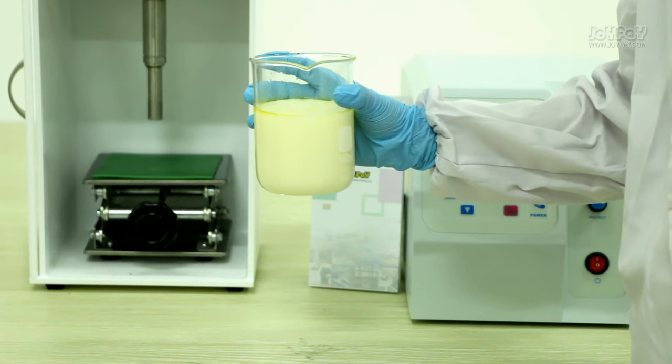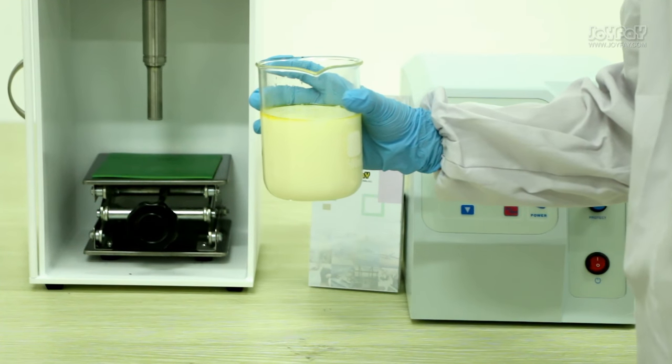Testing complete — you can see that the water and oil are mixed with each other perfectly.